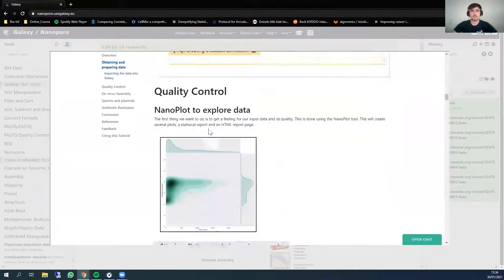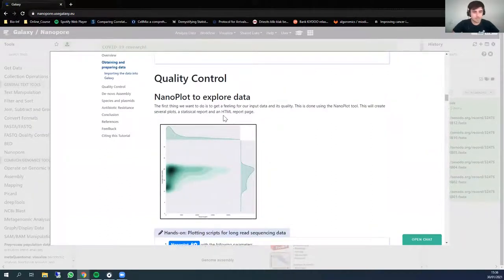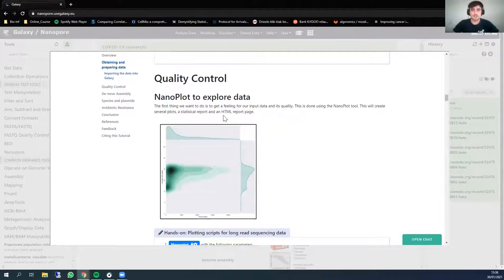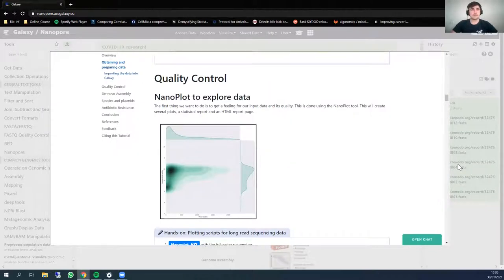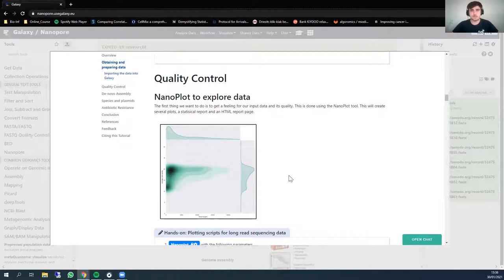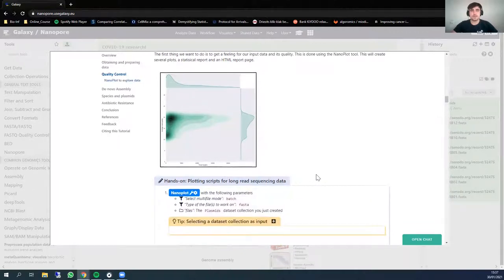The next step is quality control. When you get sequence data, you want to check whether the quality is sufficient before data analysis. There is a tutorial on quality control on the Galaxy website as well. In our case, we just uploaded FASTA files, which means we don't know anything about the quality of each nucleotide, so there is not much to do in quality control. But I still want to show you NanoPlot to demonstrate what it does — at least showing the distribution of the length of your sequences to see whether that is what you expect.